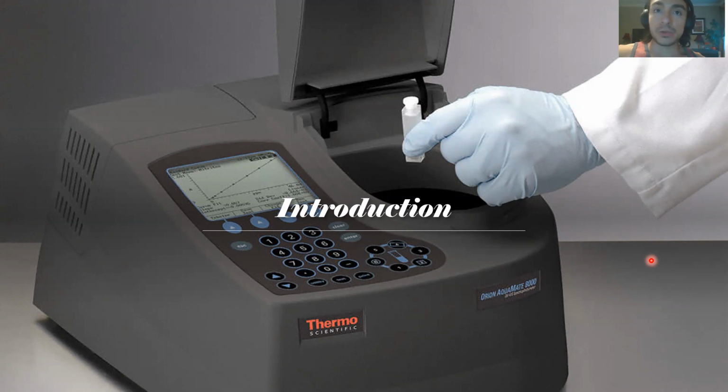Depending on the range of wavelength of the light source, it is usually classified into different types. We have ultraviolet, visible, and infrared regions. The UV-visible spectrophotometer uses light over the ultraviolet range, which is 185 to 400 nanometers, and the visible range, which is 400 to about 700 nanometers on the electromagnetic spectrum. The IR spectrophotometer, the infrared, uses light over the infrared range, from 700 to 50,000 nanometers on the electromagnetic radiation spectrum.